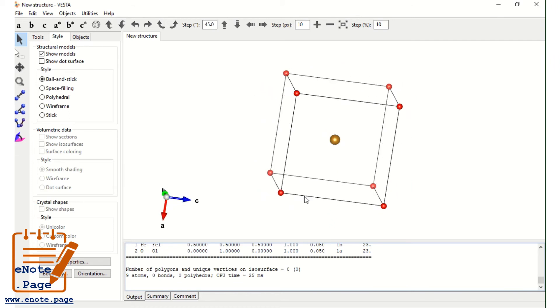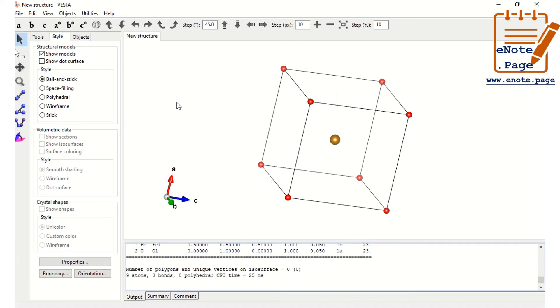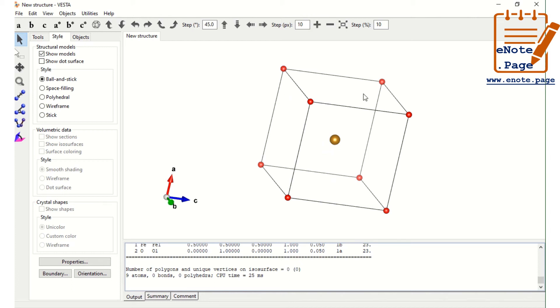We have placed the Fe atom in the center — 5 angstrom along the x-axis, 5 angstrom along the y-axis, and 5 angstrom along the z-axis. Similarly, we have placed the oxygen atom at 0 angstrom from the origin along the x-axis, 10 angstrom along the y-axis, and 0 angstrom along the z-axis. To understand this more clearly, let us move to one more step.